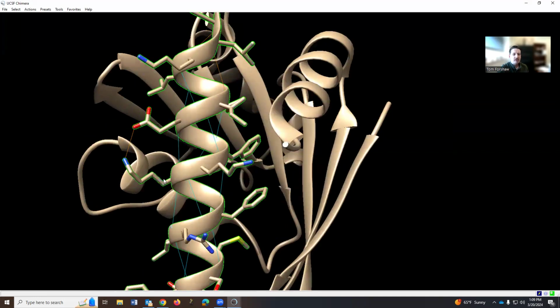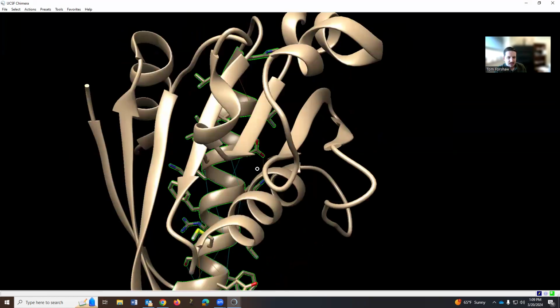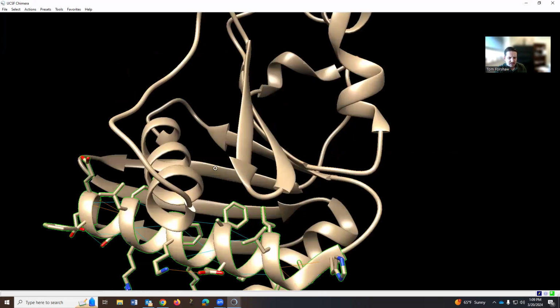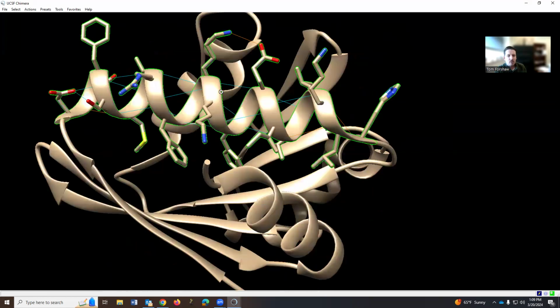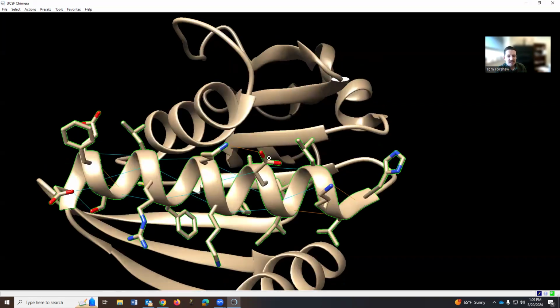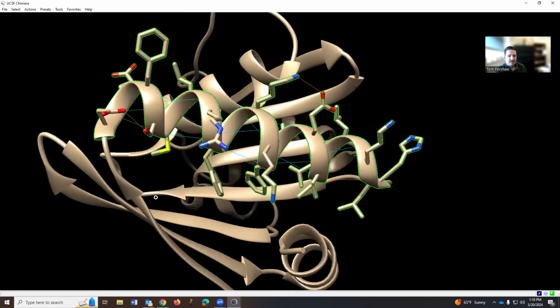This is what I was talking about when I was talking about protein structure. See, every 4 amino acids, they're lining up in order to stabilize in the helical formation. And even every 4 amino acids, you may get side chains between this lysine and this glutamic acid. You can see that hydrogen bond is formed between them.